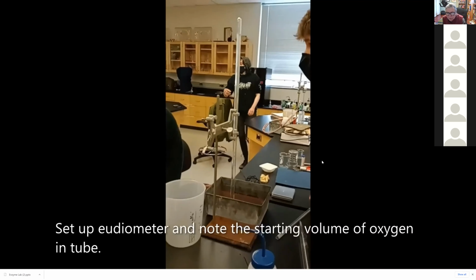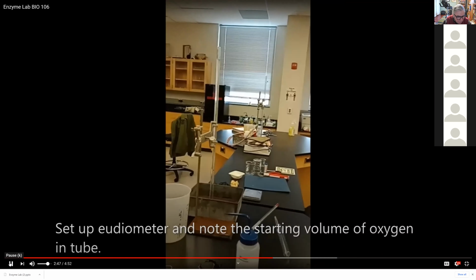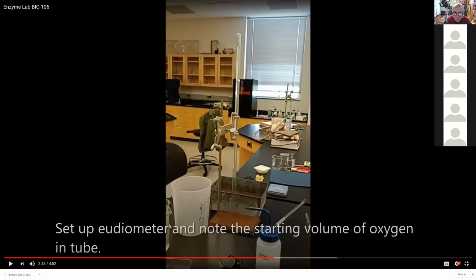And this is called a Buchner funnel, second filtering step. Well, the eudiometer. Let me pause this thing. This thing right here is called the eudiometer. It's graded, and you fill it with water, and you put the open end of it into a tray, trough of water, right? And up here you note where you start, and you get a number of milliliters where you start, and that's crucial.